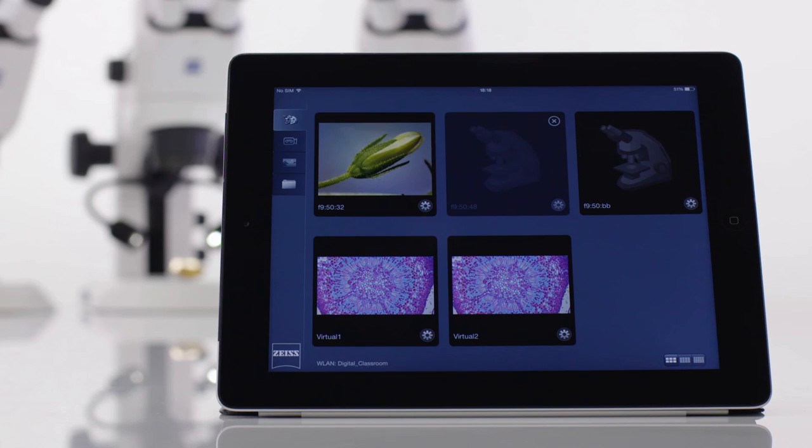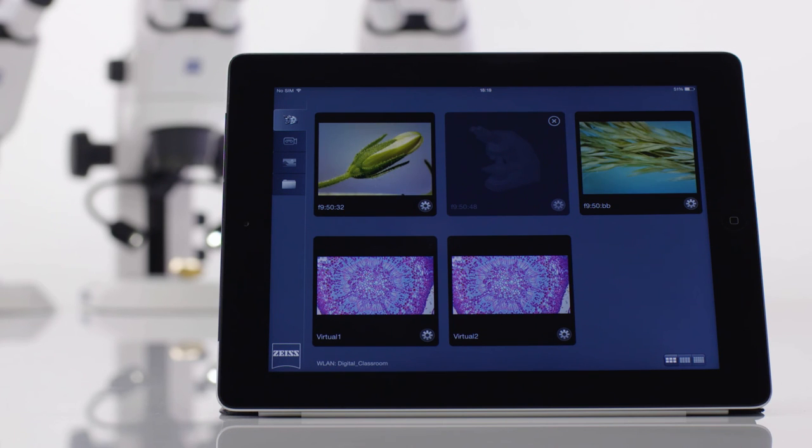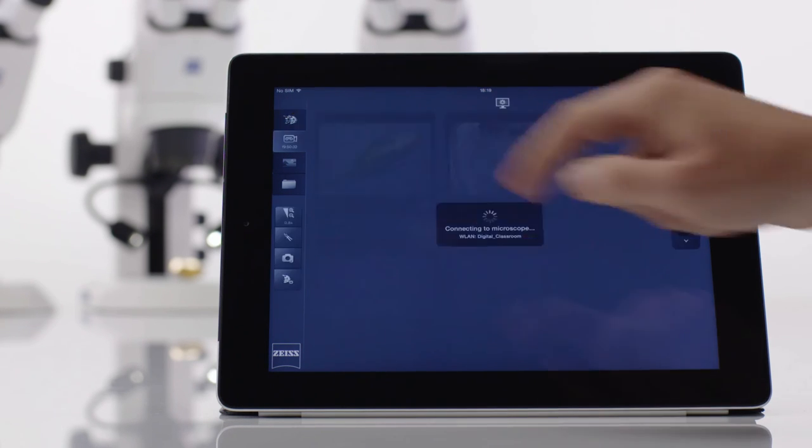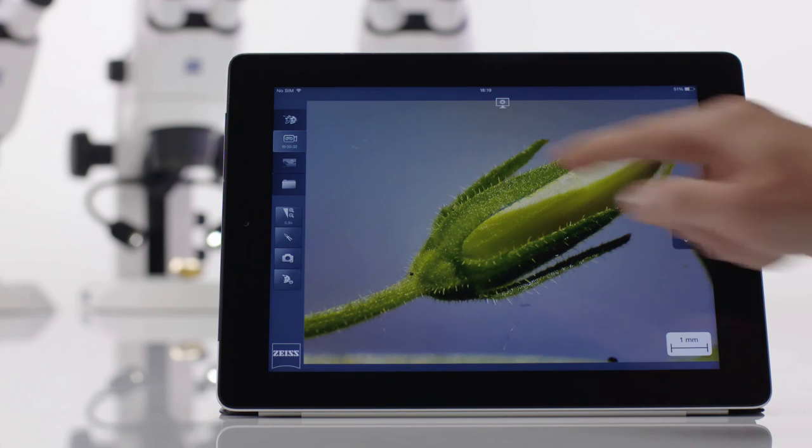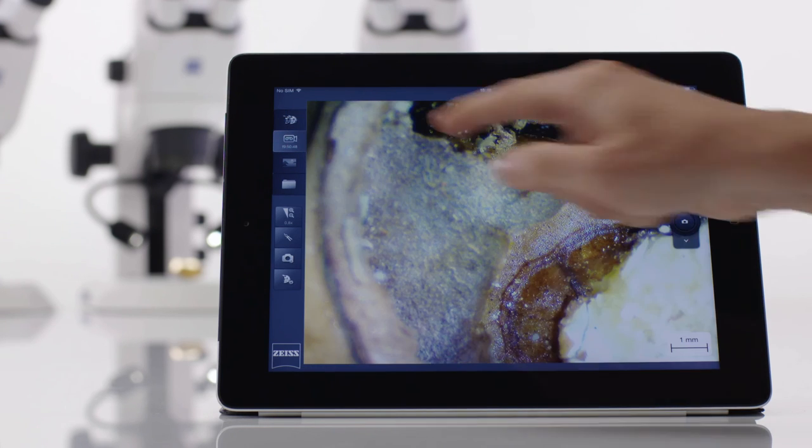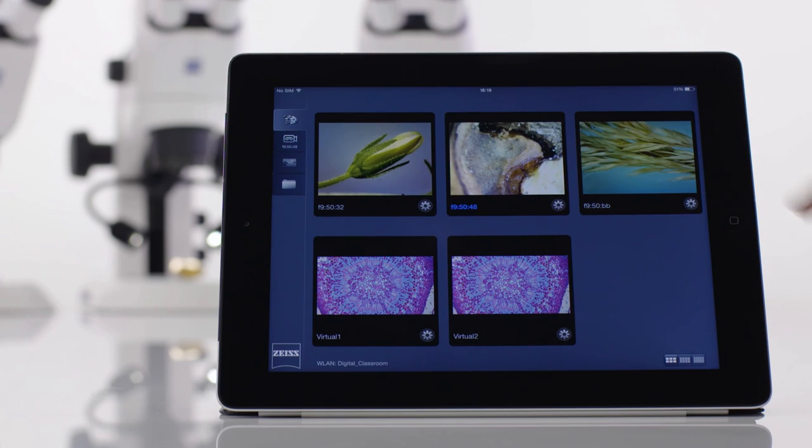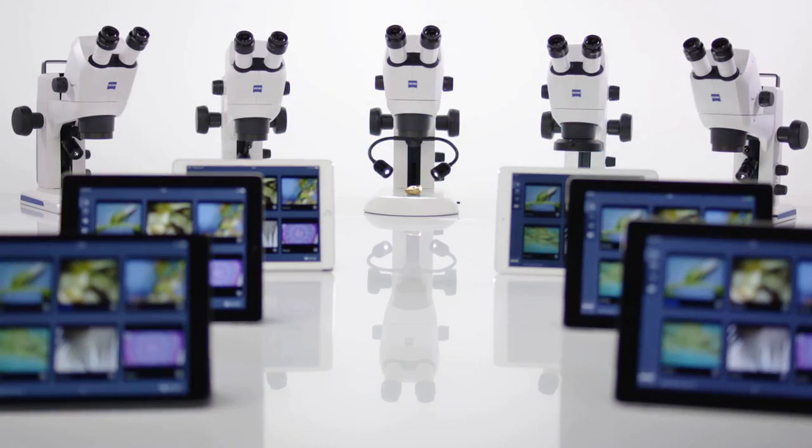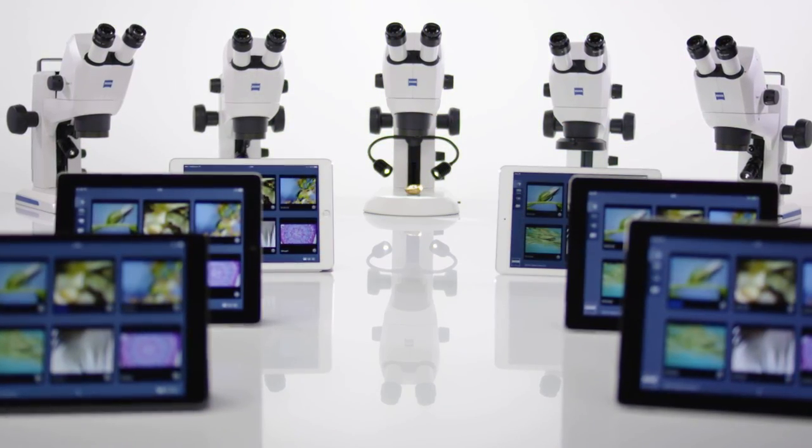As you add more microscopes to your Wi-Fi, they will show up alongside. It's that easy to switch between the microscopes. You can connect up to 10 STEMI 305 Cam and 10 iPads to any existing Wi-Fi.